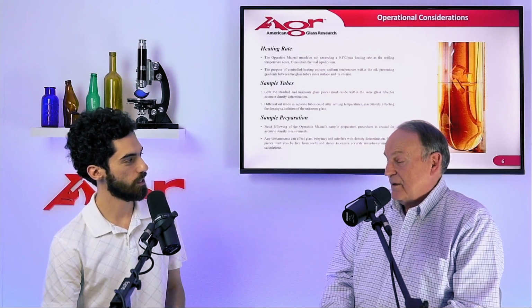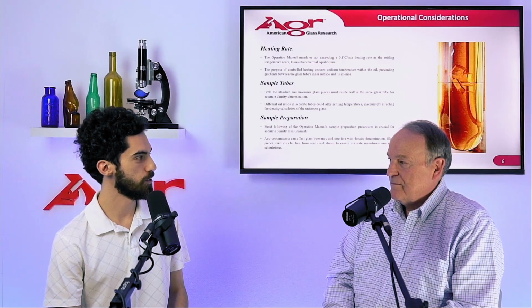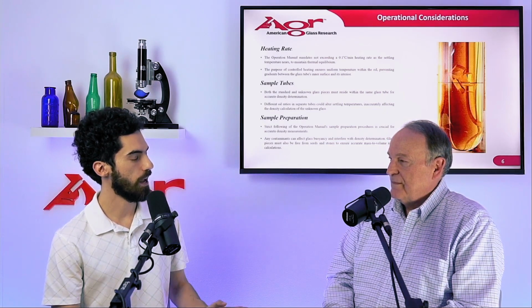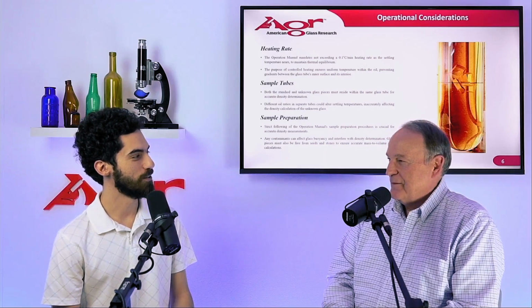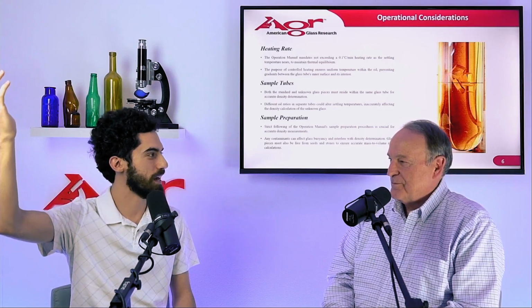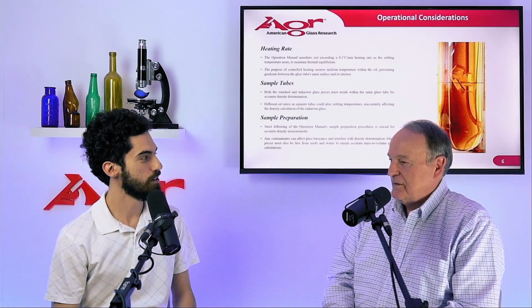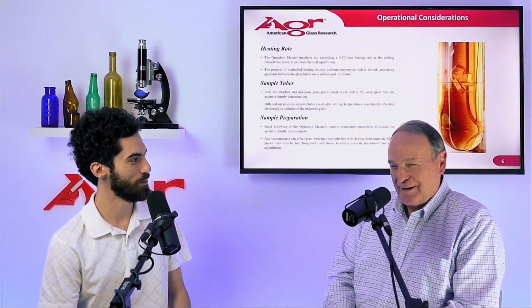Right. So now we can test all these different runs or furnaces, whatever the case may be. And that reduces that whole wait time of 20 minutes or so down to what could have been, if you're doing 5 different tests, an hour and a half or something like that, down to just 20. Just something very reasonable. Yes. Of course, now you have to pay attention to 5 different tubes.